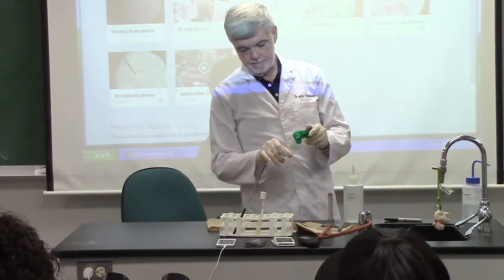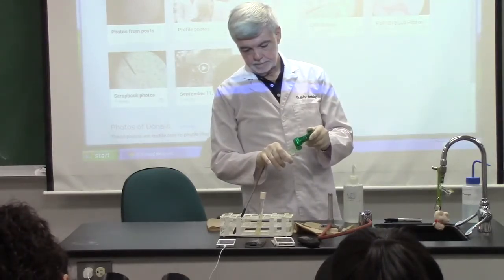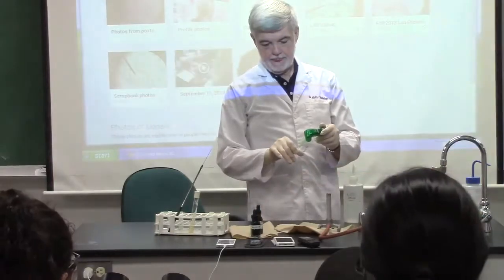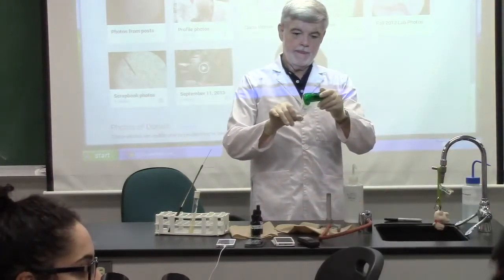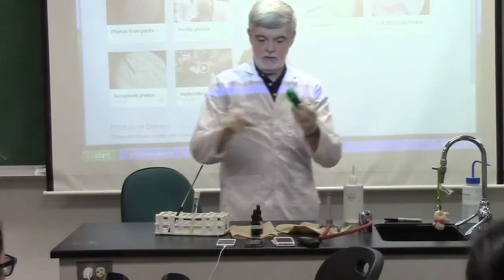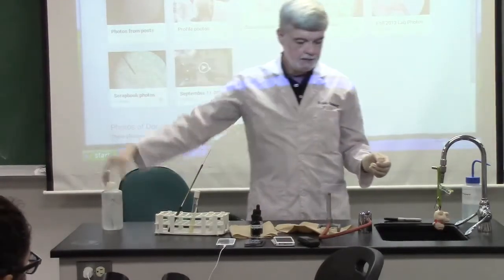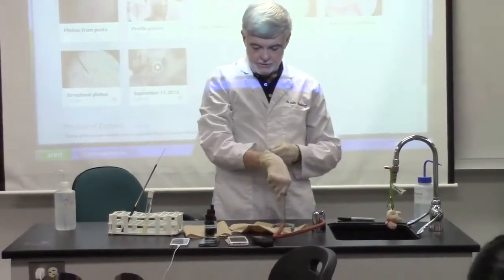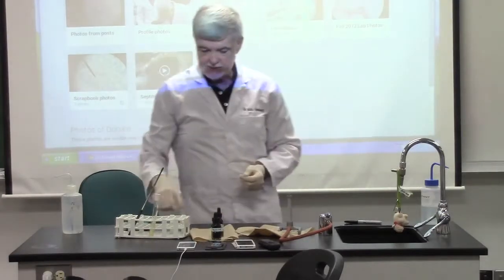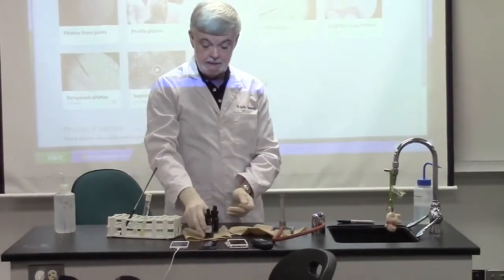Big cloudy, but slap it on that. Okay, so my circle is now dry. I don't care about anywhere else. I know it's a little bit too heavy, but I don't want to waste time. Okay, so that's that. Now I'm going to get my dome of malachite green. And remember, don't pick it up by the lid.